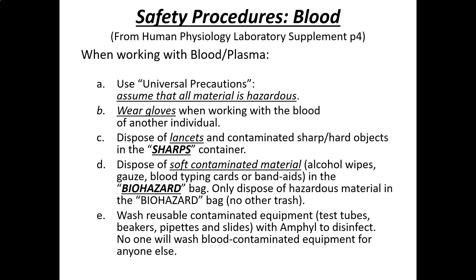The sharps container is in the laboratory for any potentially hazardous waste that has body fluid on it — blood, urine, and saliva are all examples. Because the sharps container is expensive to dispose of, we also have a different container called the softs. In the softs, you would put alcohol wipes that were contaminated, gauze, band-aids, or blood typing cards.